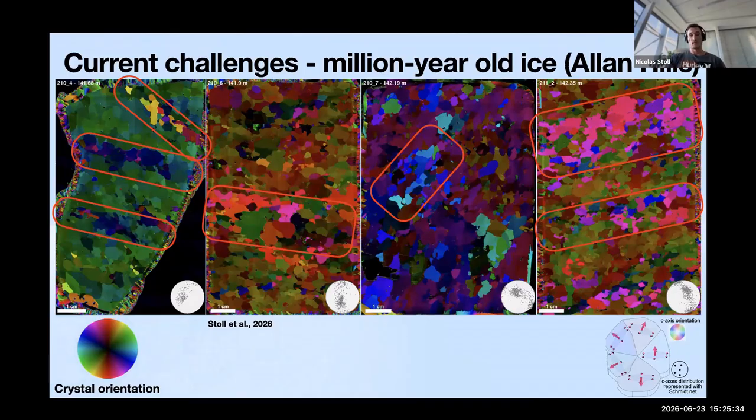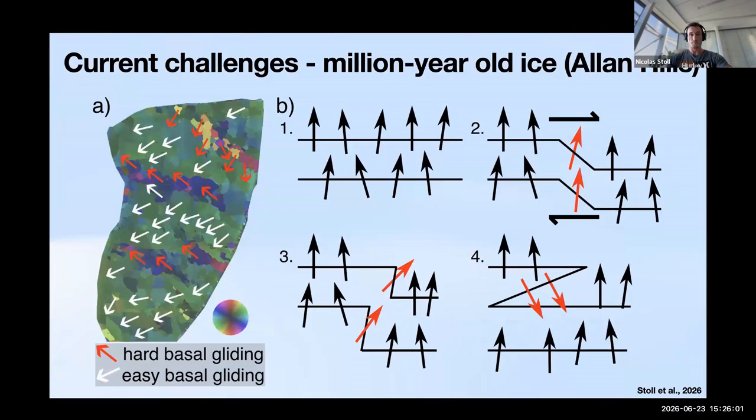yellowish direction. And this shows us that we have a lot of zones where there's different type of deformation and there's shearing. So different layers sort of in the ice that are being pushed above each other, and this on a very small scale. So you can see the scale bar, this is 1 centimeter. And this is an indicator why we might have those big jumps in the age, because the ice has just been deformed on this very small scale during the past, and it's still deforming probably.